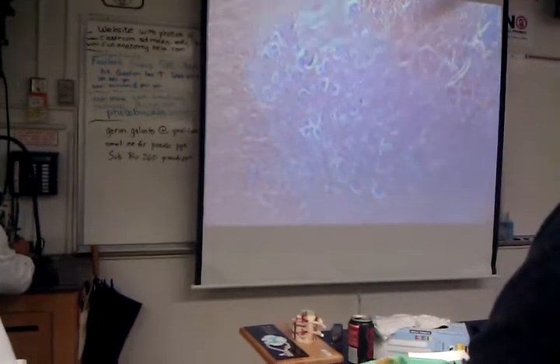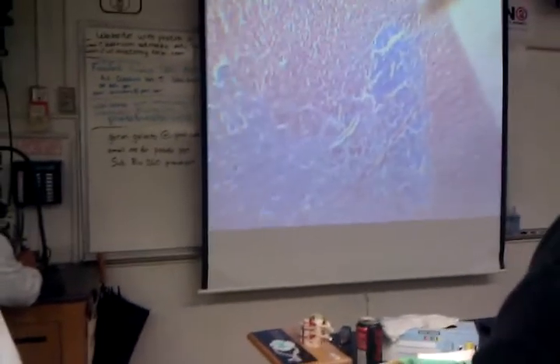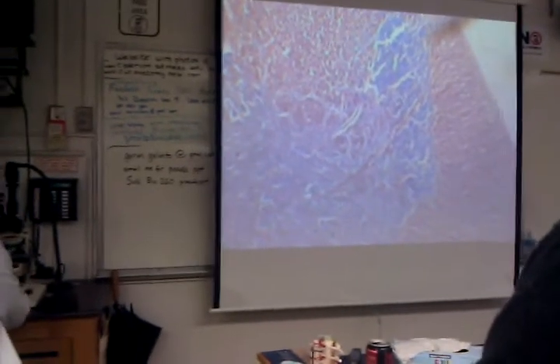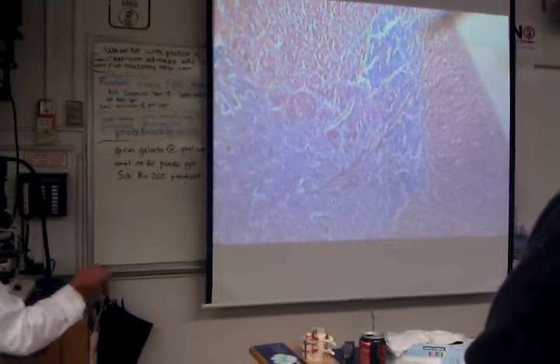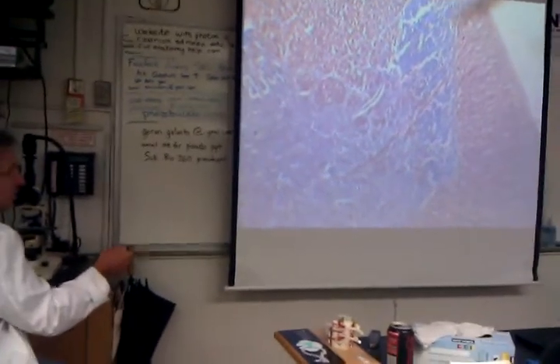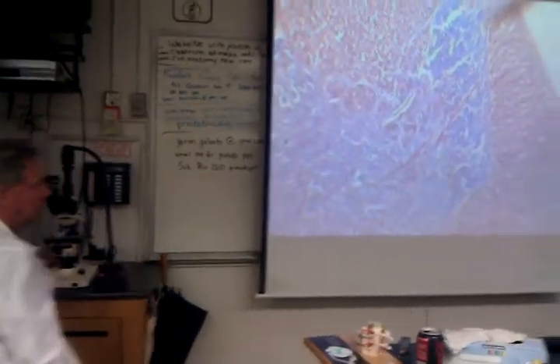And so let's look at it one more time. So we've got motor neuron cell bodies right here. That's the ventral gray horn. And then back here, this is the posterior gray horn, and right in between here is the lateral gray horn. Tomorrow night we'll talk about the autonomic nervous system, and the neurons of the autonomic nervous system are often originating out of the lateral gray horn.